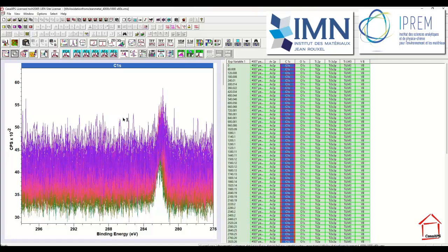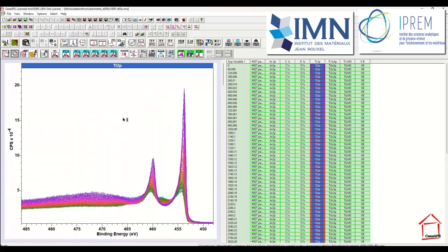And the idea of the experiment is to observe changes occurring within the titanium 2p as a result of the oxidation sequence. So we can see that the surface is oxidized with time. You can see the color coding that applies to these various blocks indicates that we started off with the metal, and it progressively oxidizes to produce a shape in the data which is very different from the original metal spectrum.